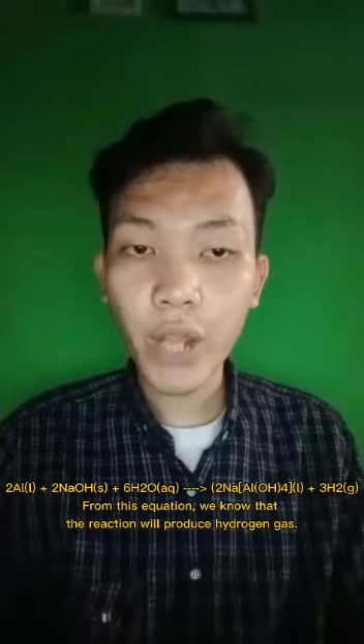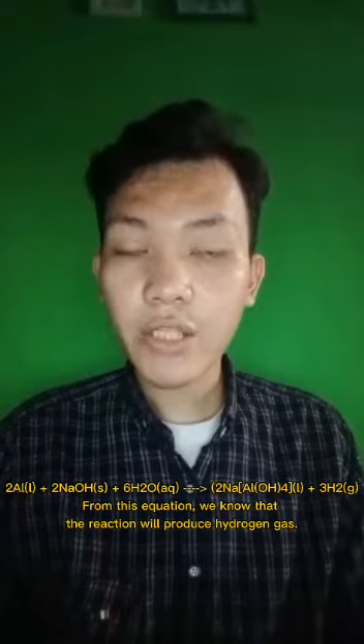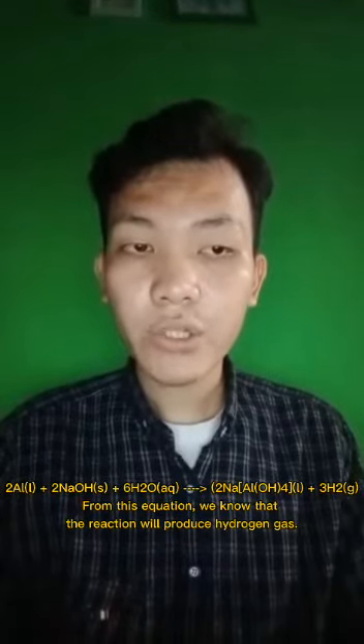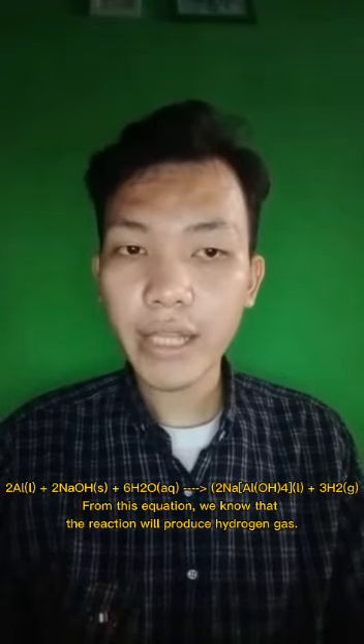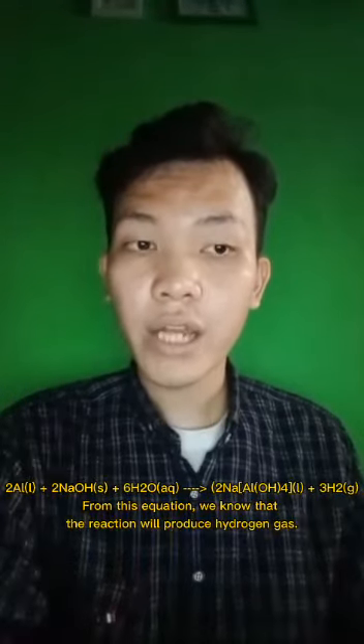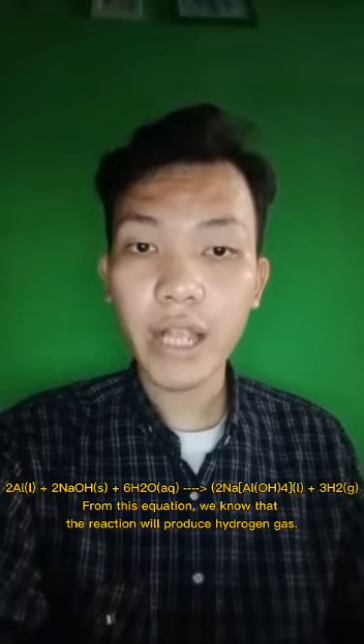The chemical equation is: 2Al + 2NaOH + 6H₂O → 2NaAl(OH)₄ + 3H₂. From that, we know that the reaction will produce hydrogen gas.